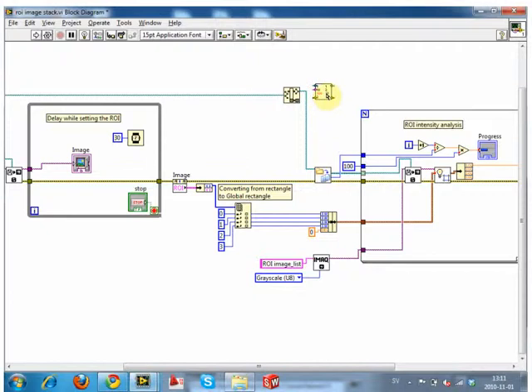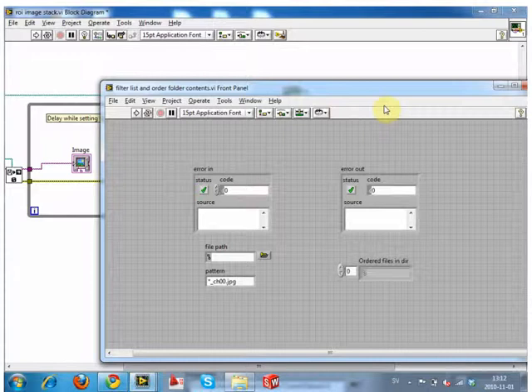What we want to do is take it one step further, and although this one allows you to filter depending on a pattern, we want to also make sure that we're filtering it and ordering it the correct way, and not the way that Windows wants to show you. Like I was saying, this is a direct replacement for this, and I'm going to show you how to not only make the contents, but how you make it into a VI so that you have these little tabs, and so that you can change your picture, so that these handy little sub-programs you can write on your own.